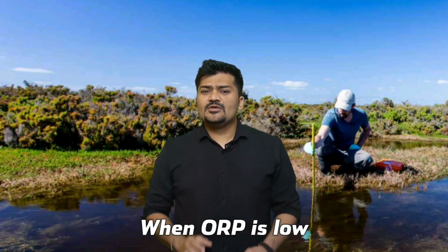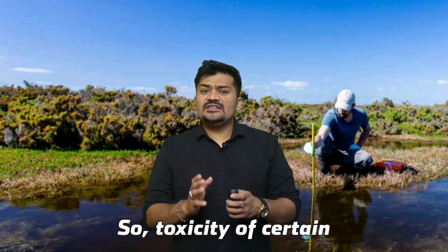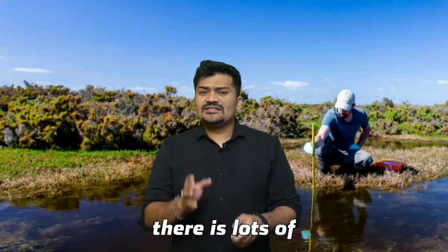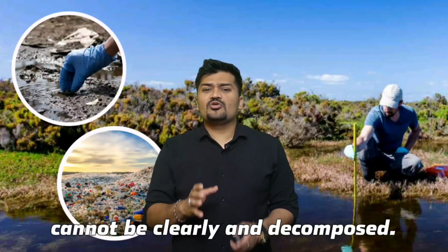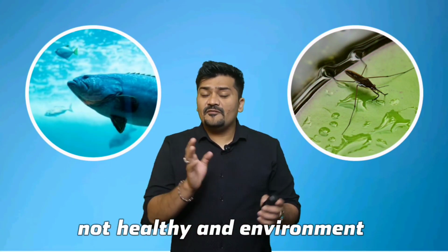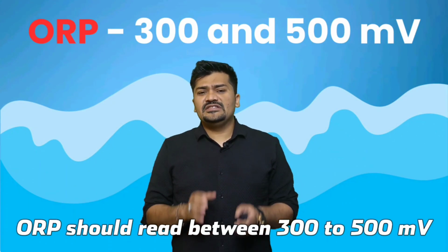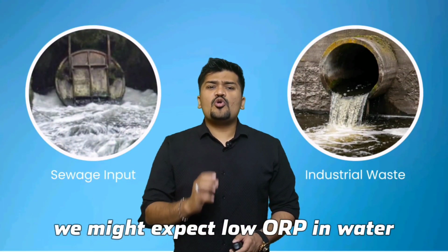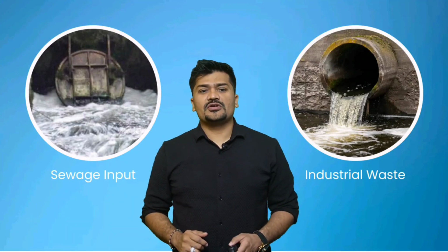When the ORP is low, dissolved oxygen is low. So, toxicity of certain metals and contaminants can increase, and there is a lot of dead and decaying material in the water that cannot be cleared or decomposed. This is obviously not a healthy environment for fish or bugs. In healthy water, ORP should read between 300 to 500 millivolts. We might expect low ORP in waters that receive sewage inputs or industrial wastewater.